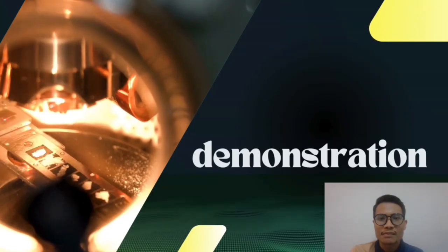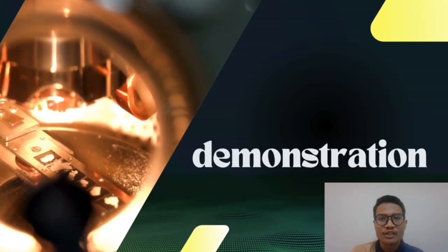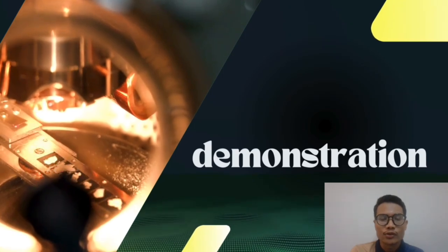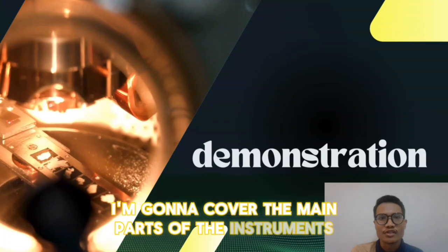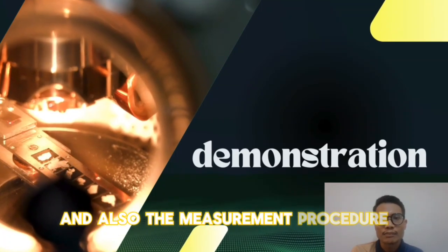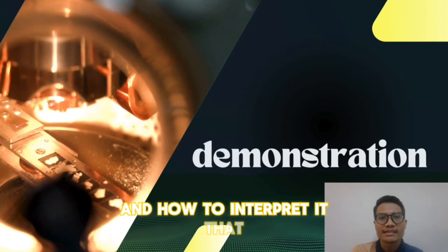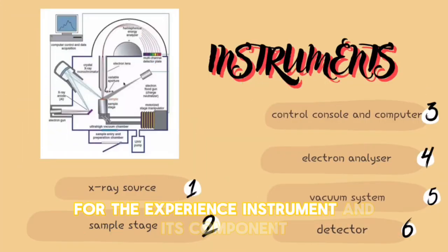So I will be explaining about the X-ray photoelectron spectroscopy XPS instrument, which is a powerful tool for surface analysis. I'm going to cover the main parts of the instrument, the sample preparation process, and also the measurement procedure and how to interpret the data. So let's start with an overview of the XPS instrument and its components.